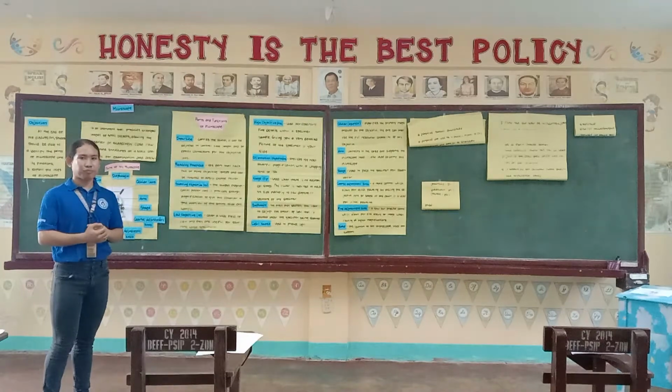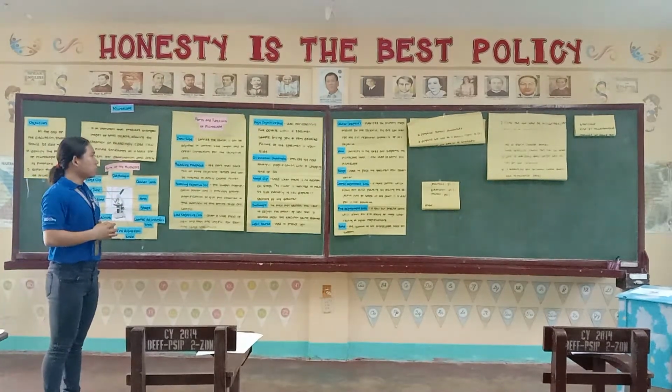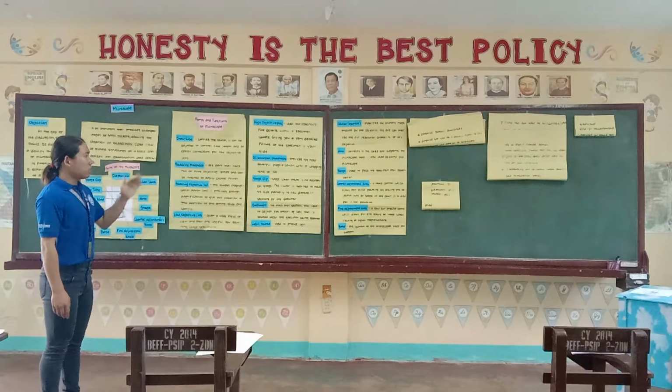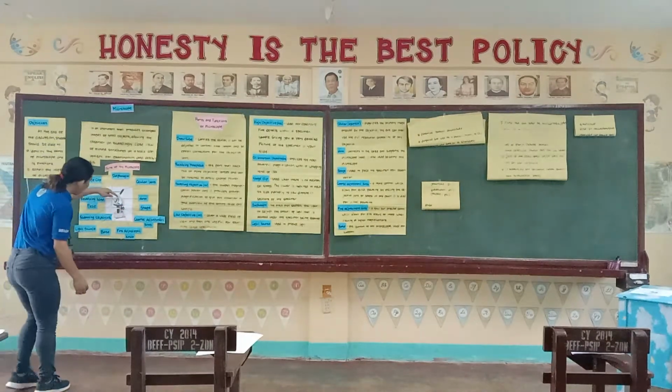So the arm, please read, Miss Pasco. Okay, the arm connects to the base and supports the microscope head. It is also used to carry the microscope. Meaning, over here, this is the arm.